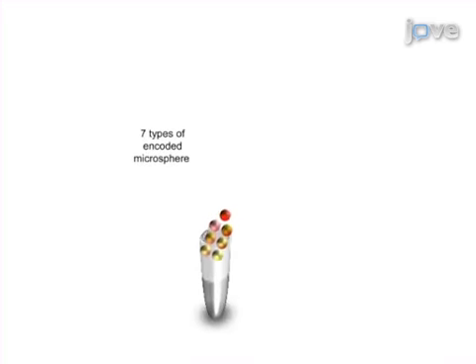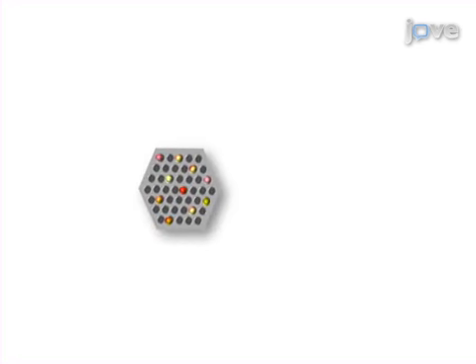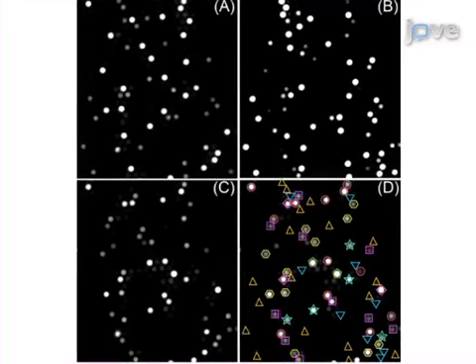Then, assemble the multiplexed protein microarray on the fiber-optic bundle. Using the sandwiched immunoassays on the assembled microarrays, assay for multiple proteins in the test saliva samples. Ultimately, analysis by fluorescence microscopy can measure the signal responses of different proteins in the saliva samples.